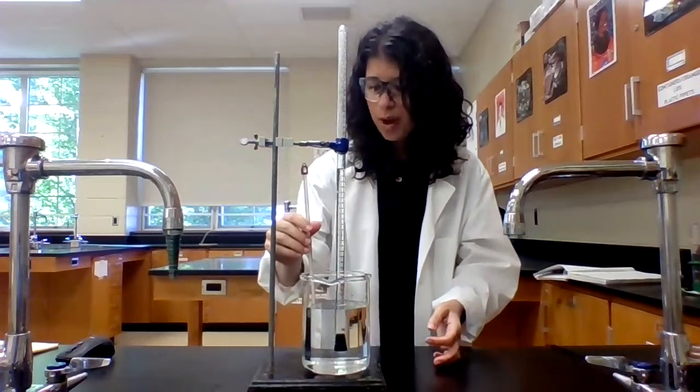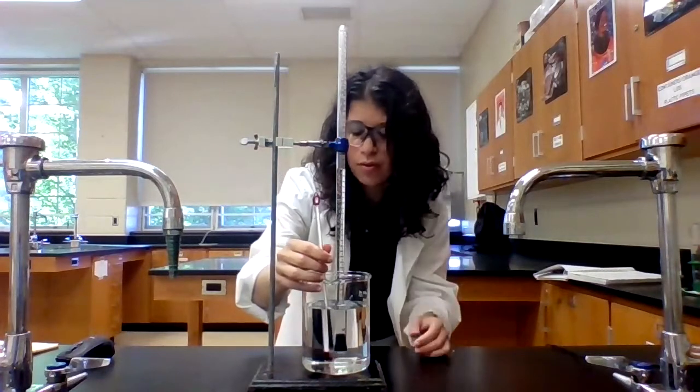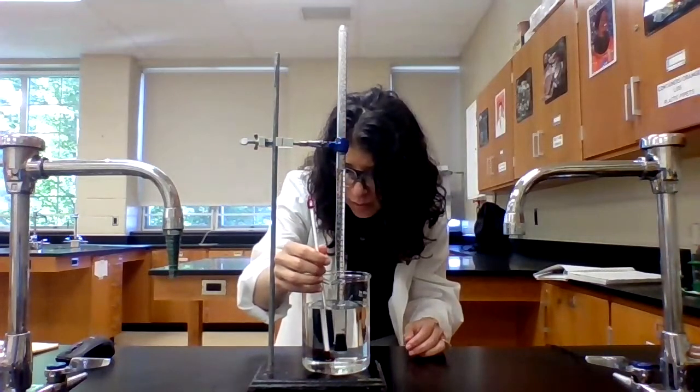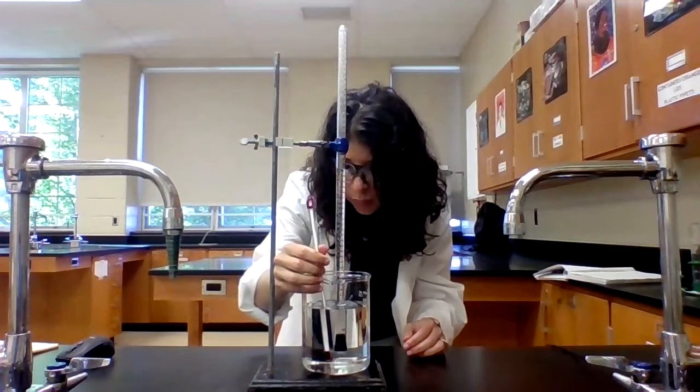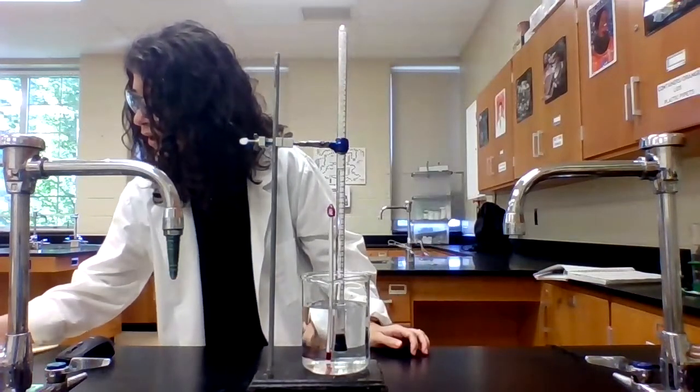So I have my thermometer here in the beaker. The water is a little bit warmer than the room temperature. And so this is reading 21.5 degrees Celsius. So I'm going to record that as well.